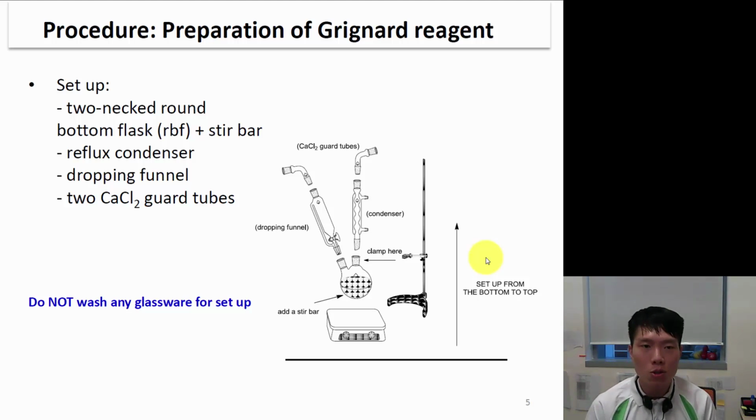So always prepare, right? Think through what you're going to do, what the experiment is going to do, the chemicals, how are they going to react. Think through all this, write down, jot down small notes. Do not just refer to the manual note and refer, okay, step 1, step 2, what do we take, how much. You should have it right here. Try your best, okay? It's a training.